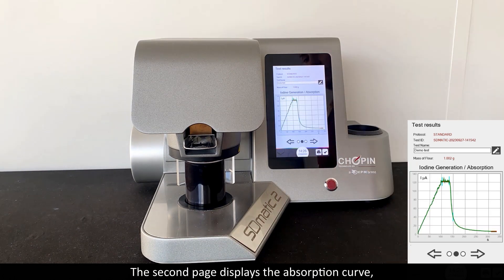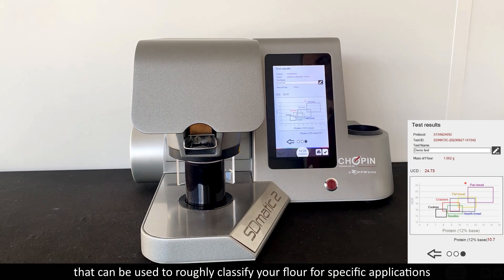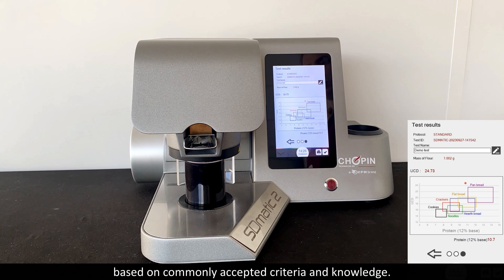The second page displays the absorption curve, illustrating how the flour absorbs iodine over time. On the third page, a protein-to-UCD graph is displayed, which can be used to broadly classify your flour for specific applications based on commonly accepted criteria and knowledge.